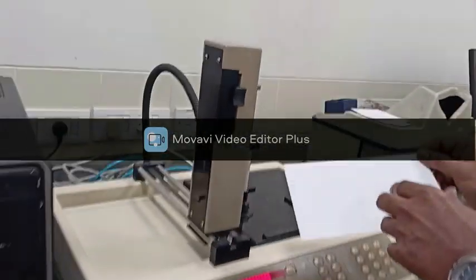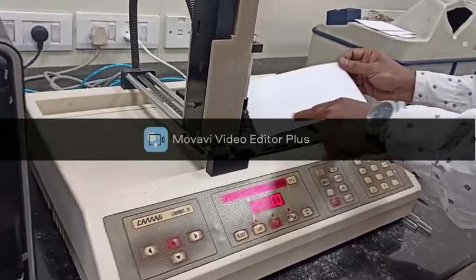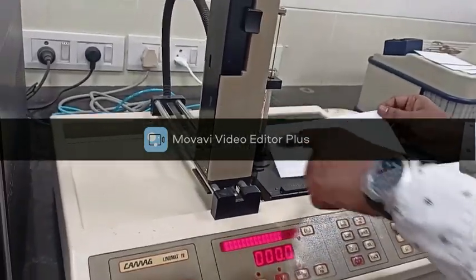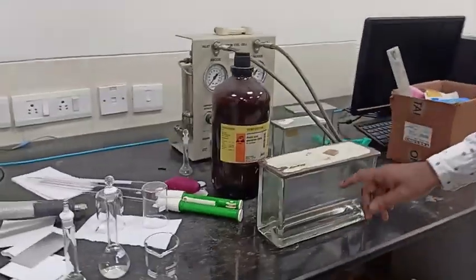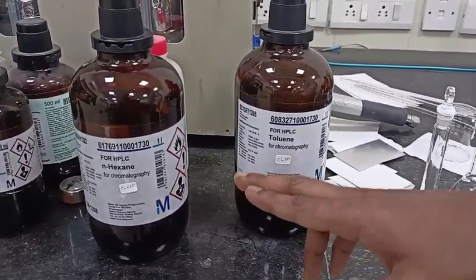Once bands are formed on this plate using the applicator, we will prepare the developing solvent from n-hexane and toluene in the ratio 3:1 inside the glass developing chamber.